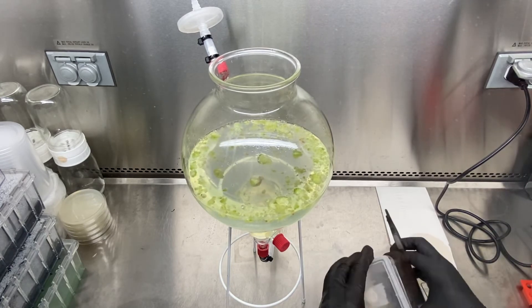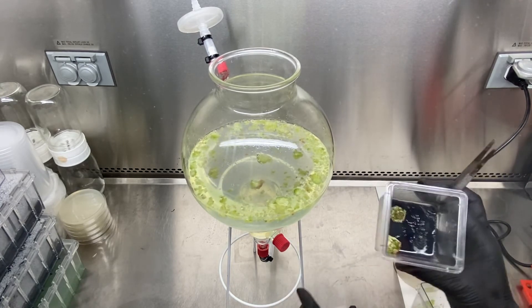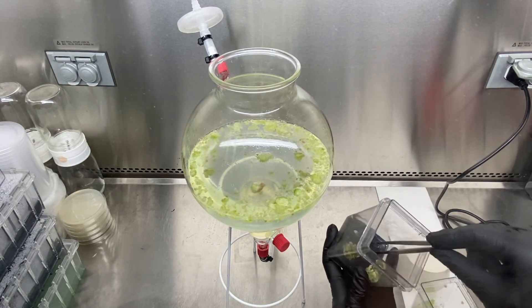The base of that box has a lot of agar, and that's something we do not want to add into the reactor.